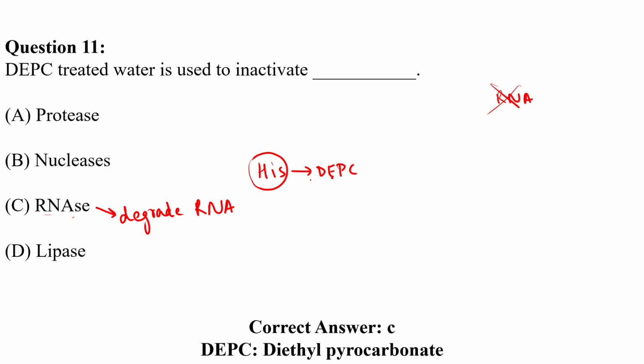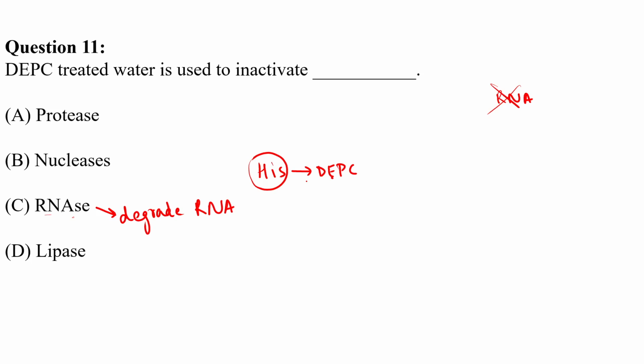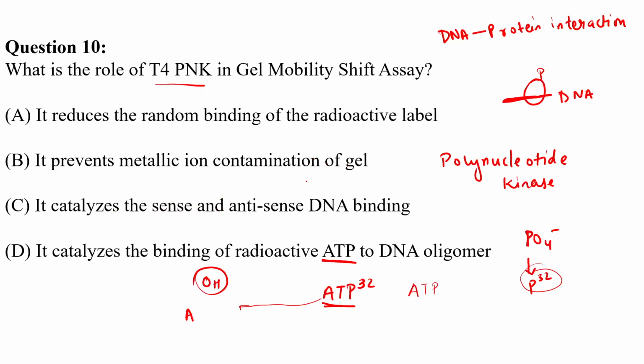Ma'am, could you please repeat that gel shifting assay question again? Gel shifting assay, this one. So, what is your doubt exactly? How is the gel shifting assay done? Yes, ma'am. I have a question coming up, so that will actually explain it. I have a figure there, and I will explain there. Okay?